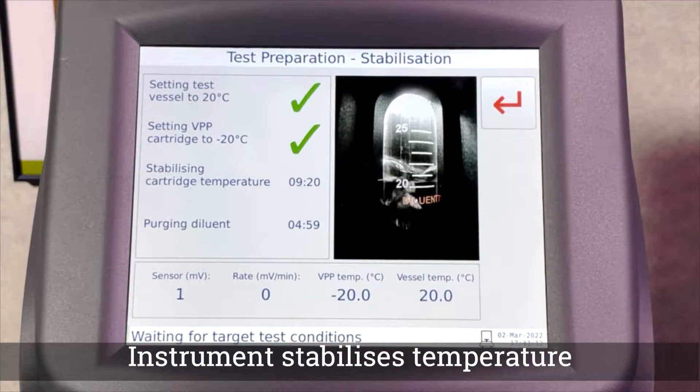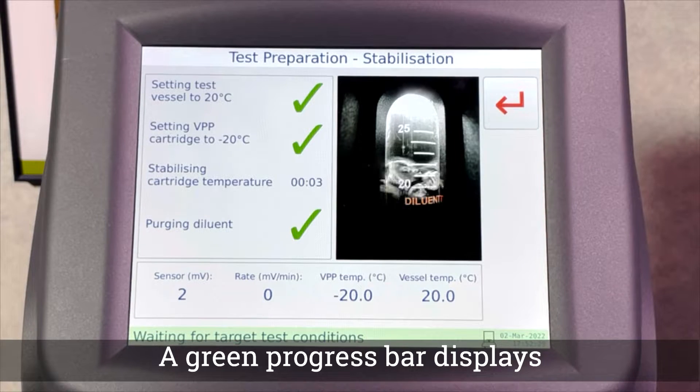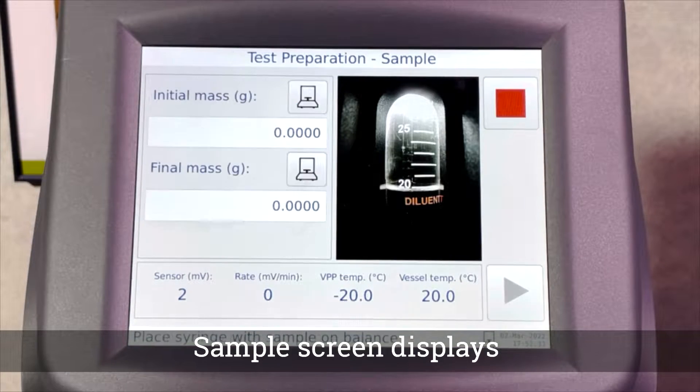Depending on the method selected, the instrument will stabilize the temperature as required. A sample cannot be added until all the countdowns have reached zero.